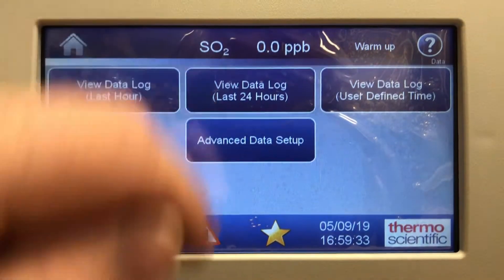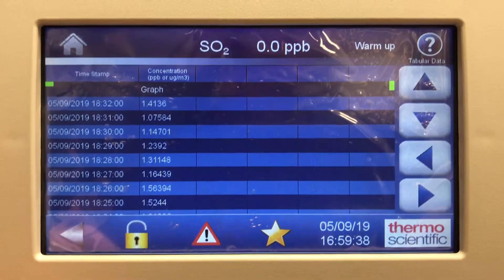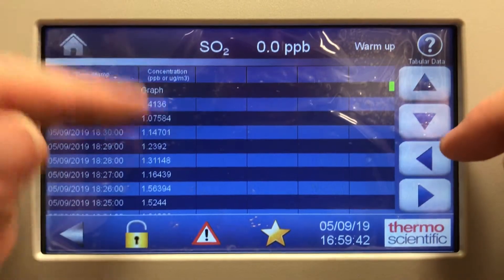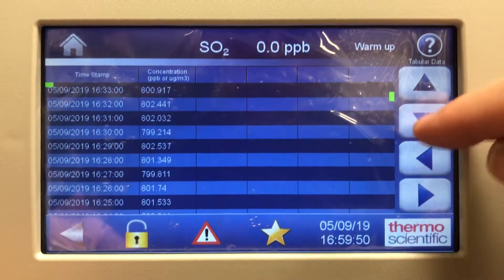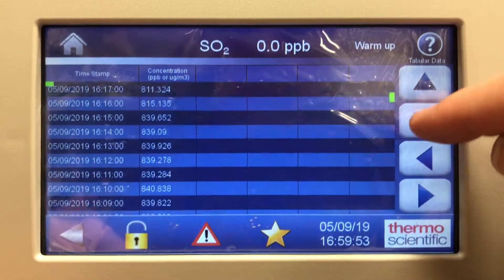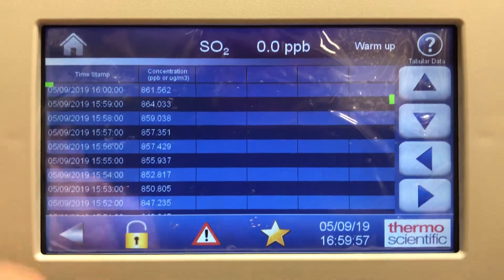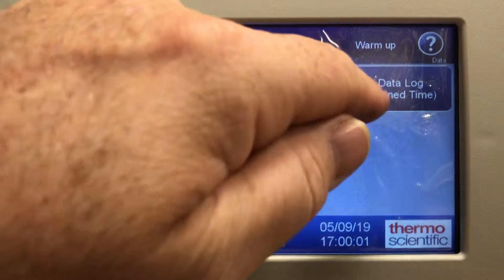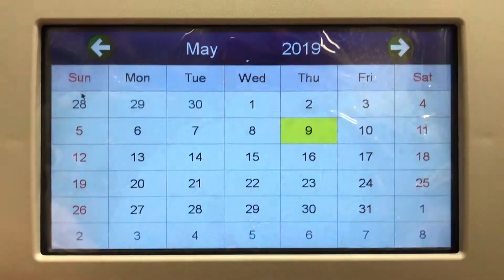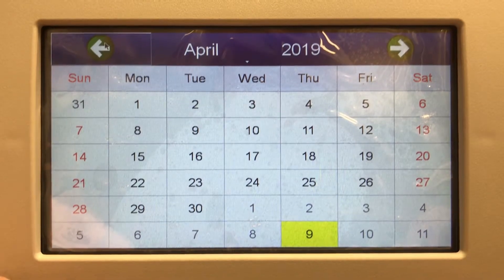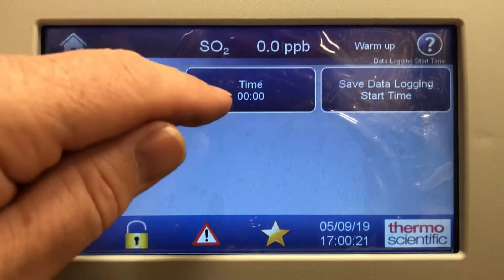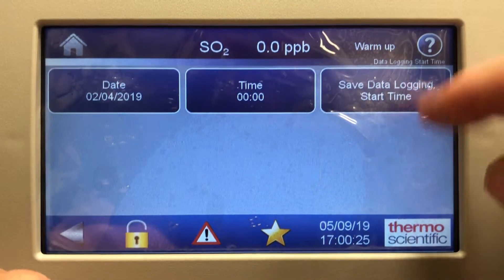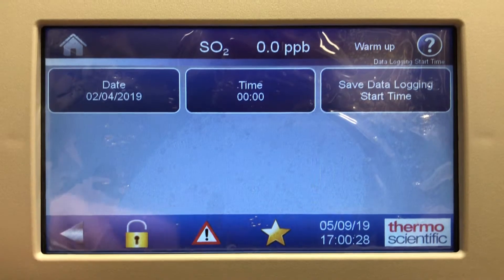Last 24 hour data retrieves user log data — this will pull up the last 24 hours of data so you'd be able to scroll down. It's the SO2 column we're looking at, and it'll pull up the last 24 hours going further back. The time is moving up in the left column. There's also view data log with user-defined time, where we can pick a date and time and save it, so we can select the time and date we want to start from.